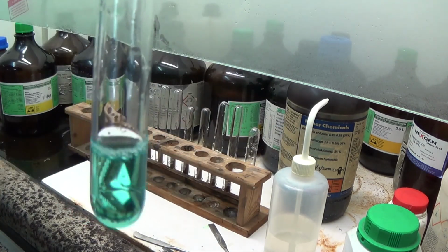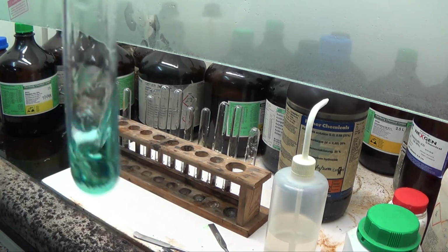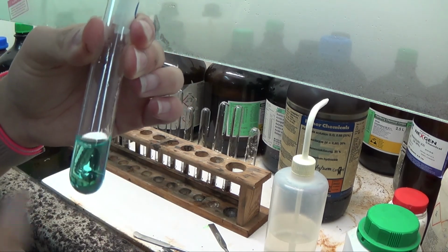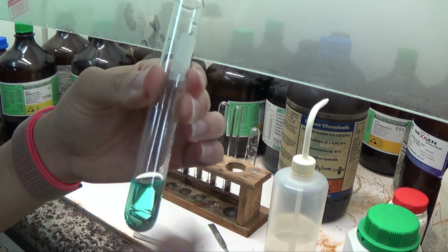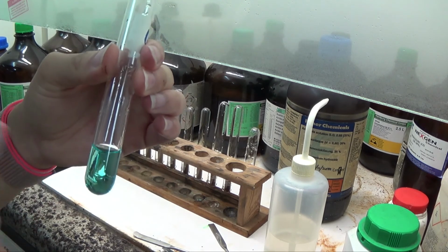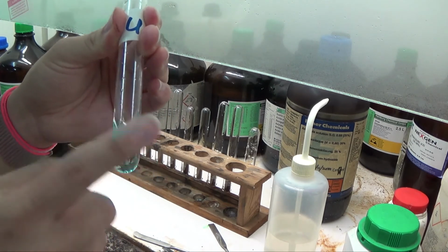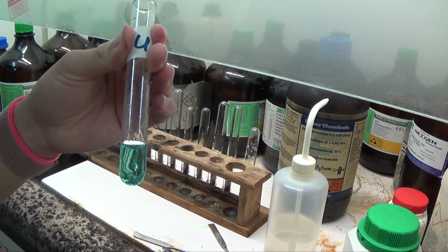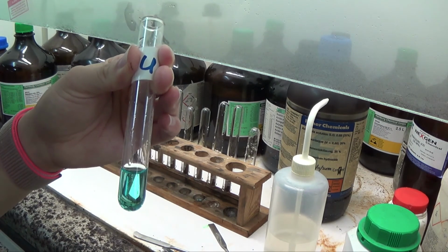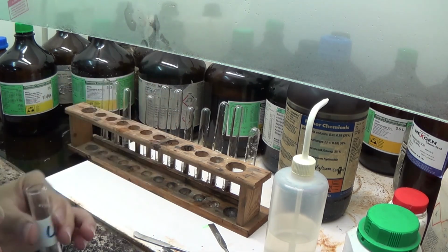It's kind of like greeny bluish in solution. And once it is in solution, you have a lot of the pale blue solution instead of the greeny color solution that we saw earlier, because in the presence of distilled water, deionized water, I've just introduced a lot of water molecules, and these water molecules just basically surround the copper 2 plus. To get back the green color species, what you do is you can add concentrated hydrochloric acid to this. They will compete with the H2O molecules, and they will replace the H2O molecules to give you back the tetrahedral complex, which is the Cu2 plus and 4 Cl minus. They will be greenish in color.